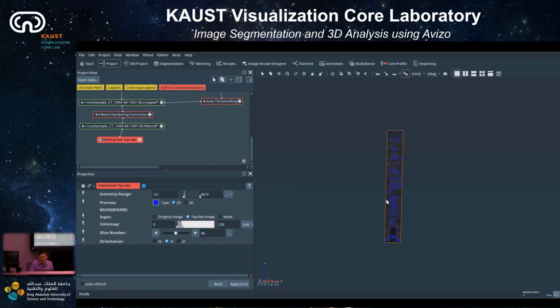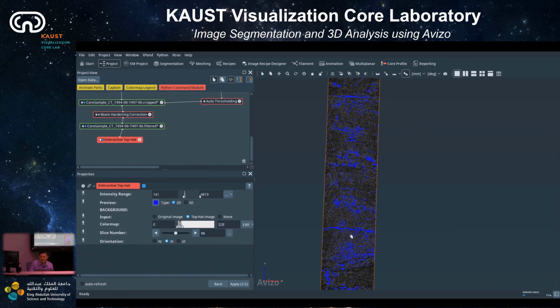Yeah, but it depends, because sometimes we are actually interested in the porosity rather than the fracture. It depends on what you would like to see, but what we capture here is the intensity of the so-called porosity. The fracture you can remove later with a filter by measuring, for example.